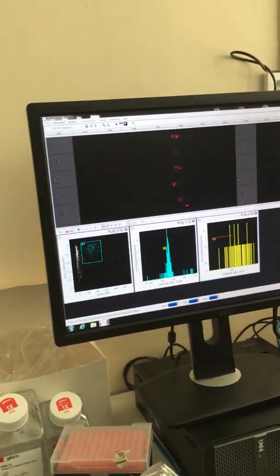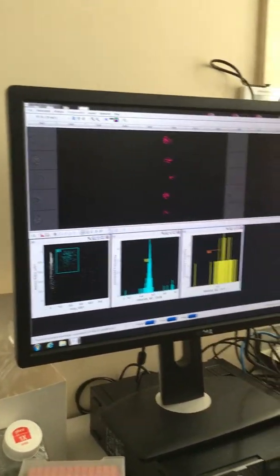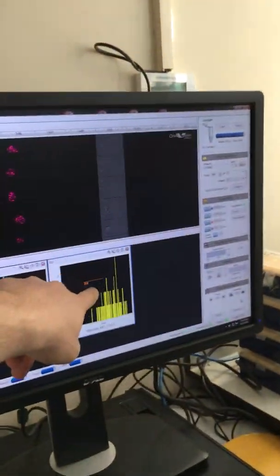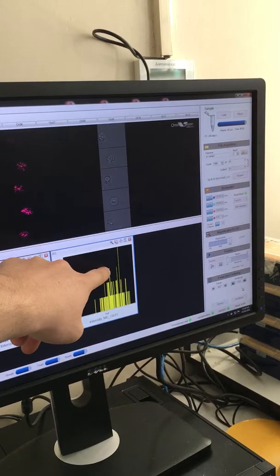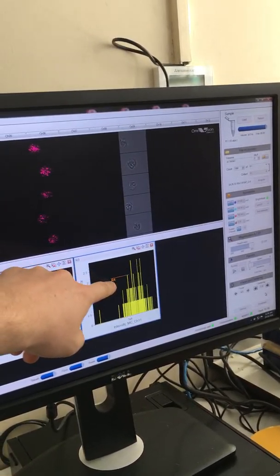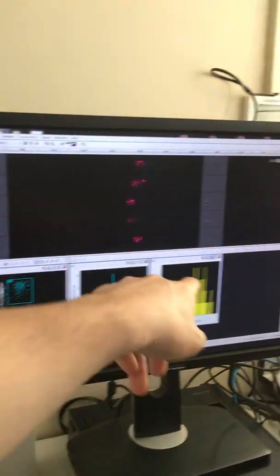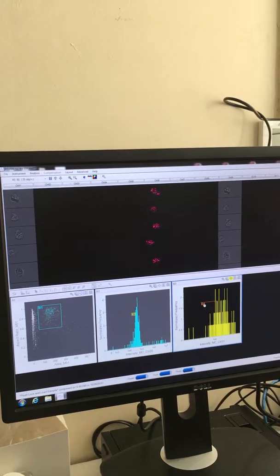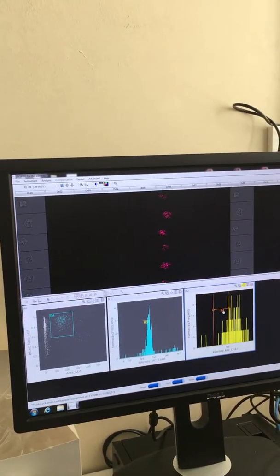Okay, new sample. Let me reset. Hopefully we see, and now you've got that shift. See, this is where R4 was last time. This is the isotype, so that's the isotype gate. Okay, so now you can move that to extend. So click on move resize region. This one? That one, yeah. And then click on 4. Click on the letter and number. There you go. And then move it.